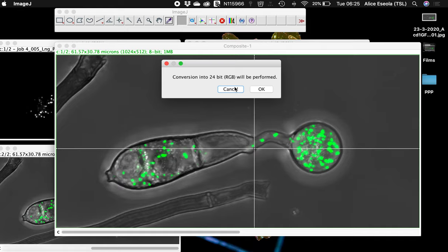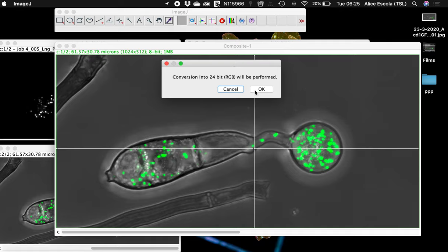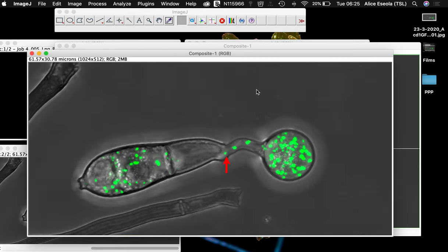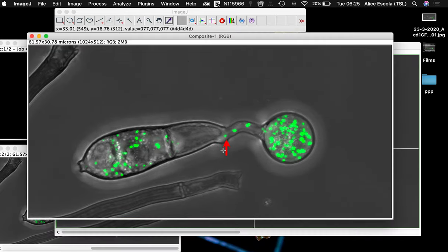When you click on apply, the software will automatically convert your image to a 24-bit colored image. That's okay, just click on okay.